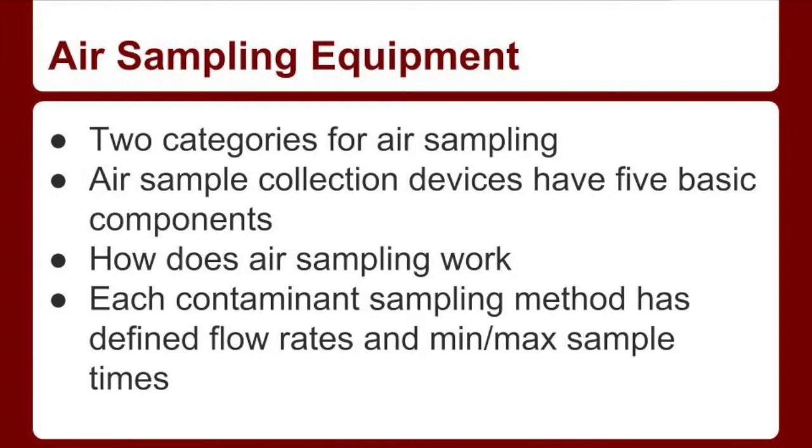A sample collection device works by pumping air into the sampling train through the orifice. The chemical is then collected on a collection medium, such as a filter. The size, shape, and position of the air inlet orifice can greatly affect what is actually collected from the air. This is particularly true when sampling particulate exposures.